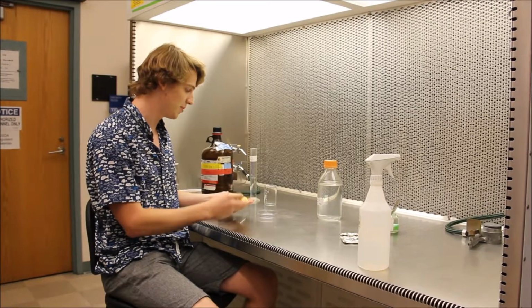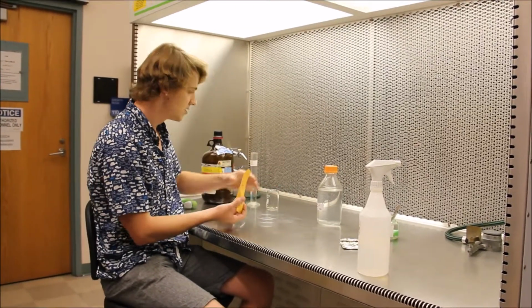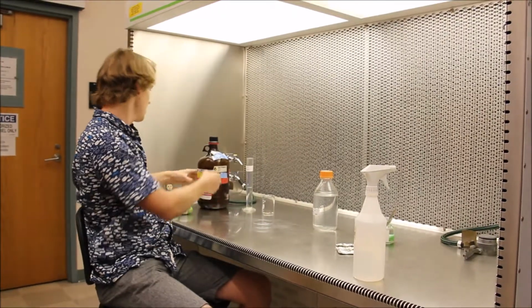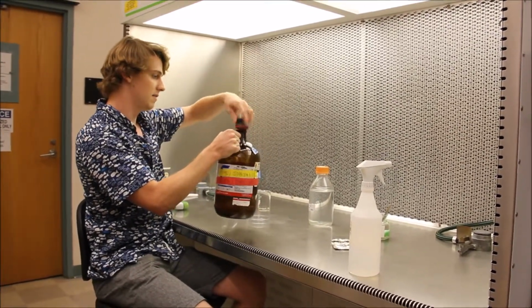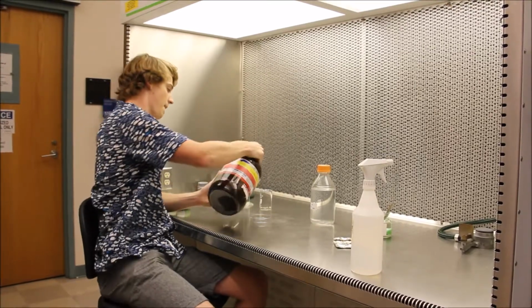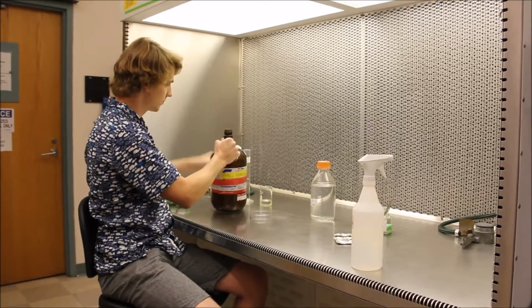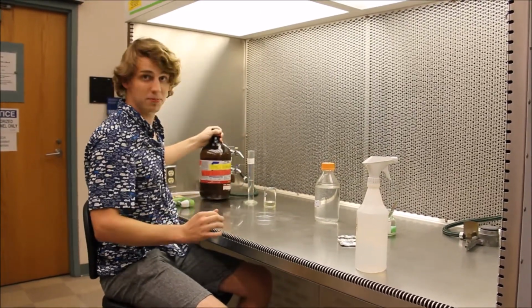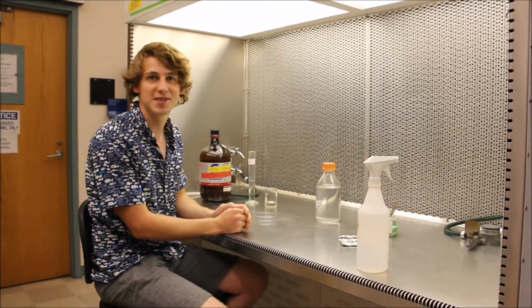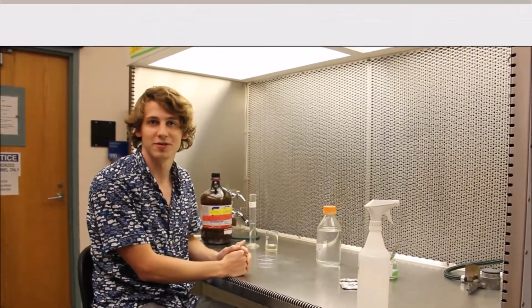The first important thing to do here is to sterilize your seeds. So we'll put some in a beaker. We're going to add some isopropanol, 70%, for 30 seconds. The next step will be rinsing them with 20% bleach for 5 minutes. And then we'll get them ready to go into the dark room for germination.